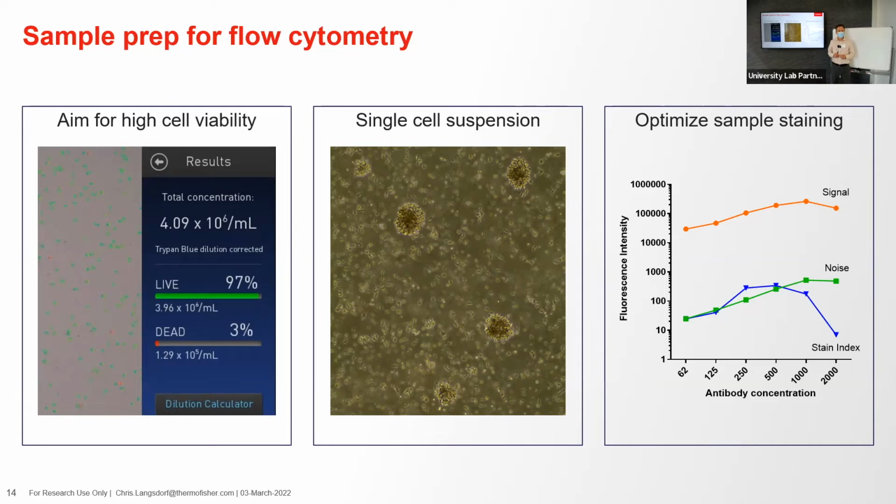EDTA sometimes is helpful. And then that inhibits the... Yeah, and it can affect other markers you're looking at too. Different enzymes, just depending on the model. There are various different enzymes you can digest your samples with. And I think there's a whole web page just for that, how to take your given tissue, and here are the different recommended ones. AccuTase, yeah.